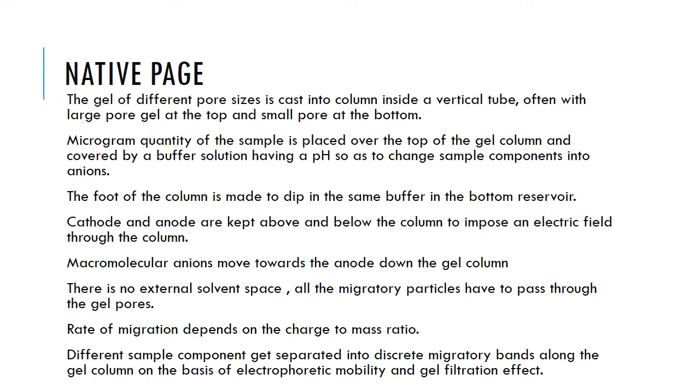So remember, when we are dealing with electrophoresis, there is an electric field that brings about the movement of molecules. Negatively charged molecules move towards the positive, and the positive move towards the negative. In this context, there is nothing in place apart from the buffer solution. This buffer has a certain pH, so that once it comes into contact with a protein, the proteins will be charged. They will become anions.